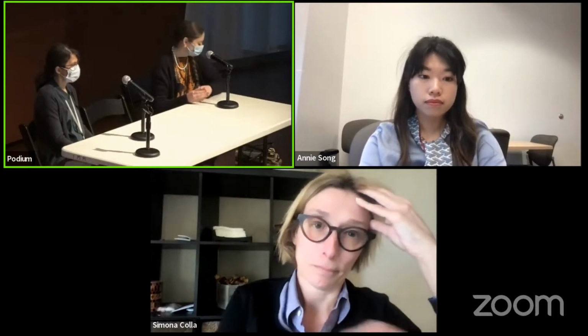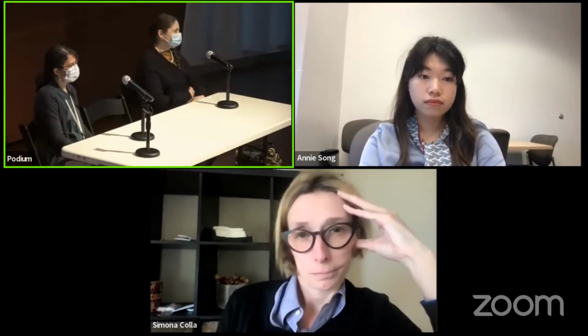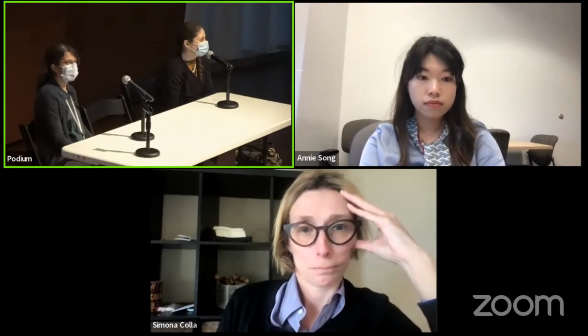Yeah, so the next question is from Deanna from Peter. This is also to Tricia. Can you comment on the genomics impact of cellular debris from cell sorting? So do samples for sorting with a lot of debris give bad genomic results, even when you try to sort single cells? Yes. I think the short answer is yes.